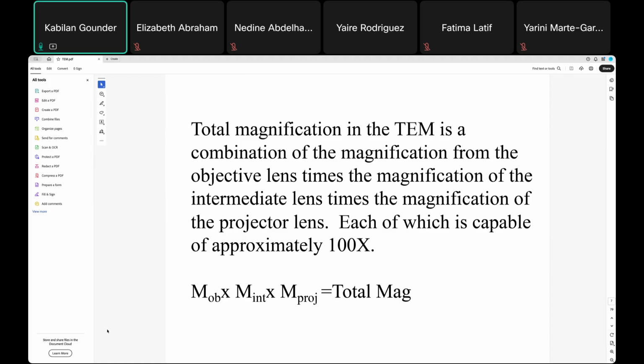So already we discussed the reason why you wanted to emphasize more on the magnification. The magnification is because we took a small piece of a sample for processing and you are taking sections.